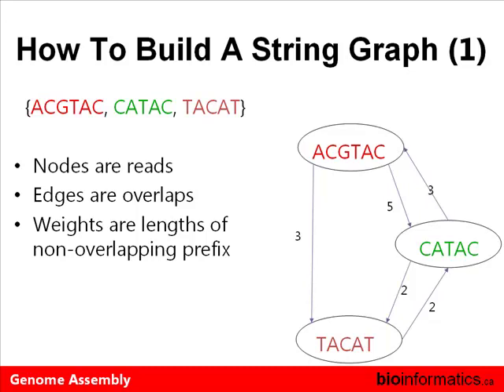Basically, whenever you have an overlap, it indicates that you have two pieces of DNA which you have actually read from two different reads. If there is a sequencing error, which is an indel, you want to be able to model it, and hence you will allow for overlaps which are not perfect, including indels or sequencing errors. I guess I also wanted to ask, what's the reason why you were not allowing indels for Solexa and SOLiD, because of the deep coverage?